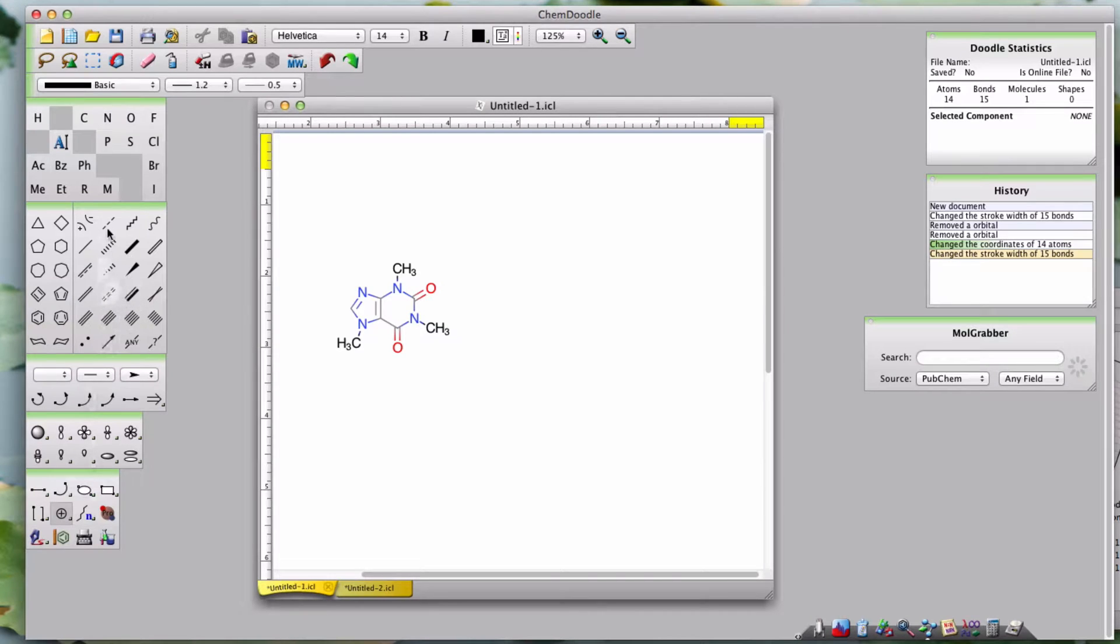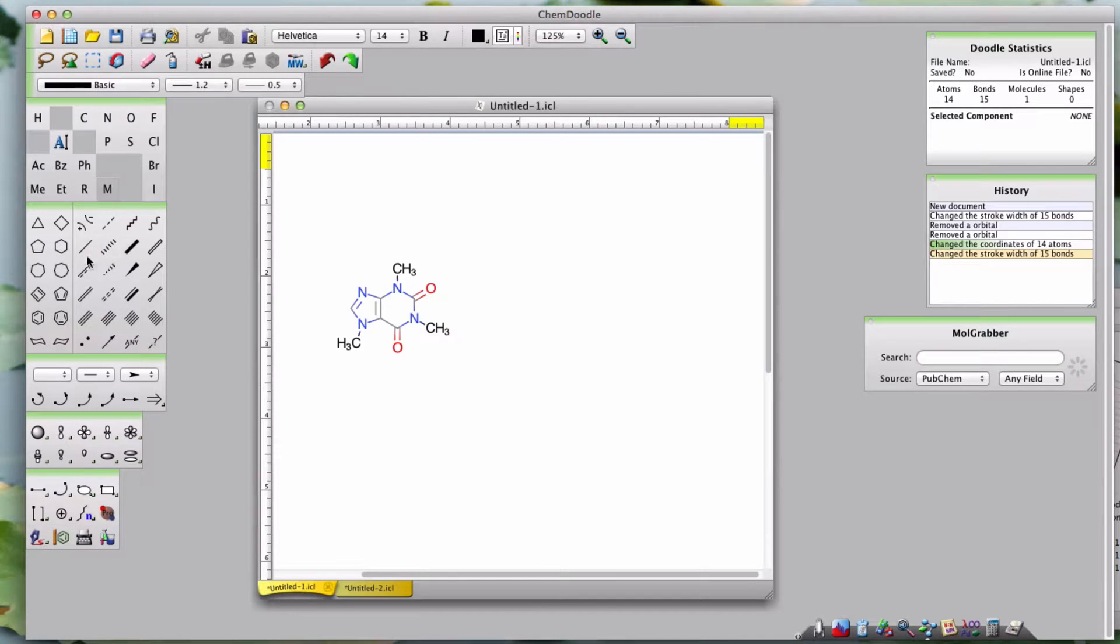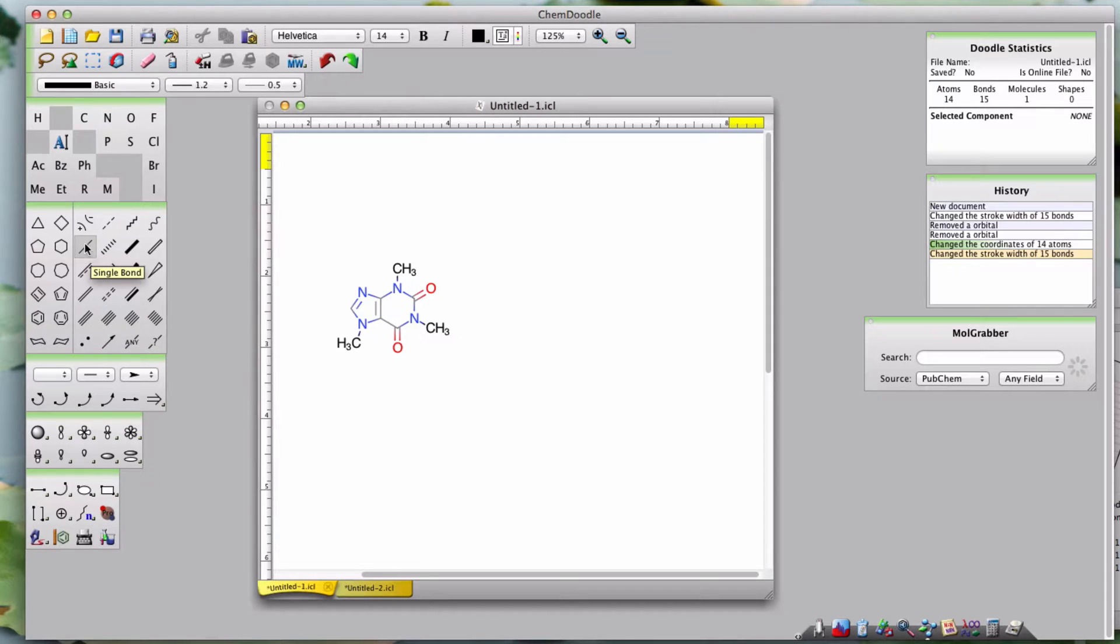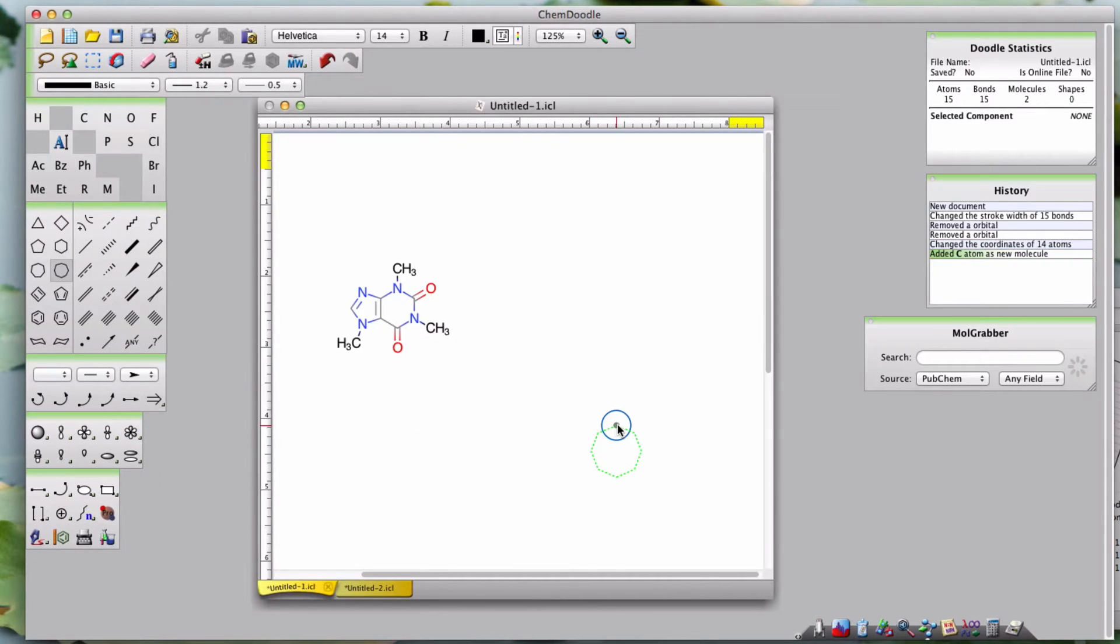Think of every button on all six of these toolbars as radio buttons. Just like on an old style radio, when you push one button in, all the other buttons on the radio are pushed out or deselected. You can't have a methyl group and a cyclooctane ring selected at the same time.